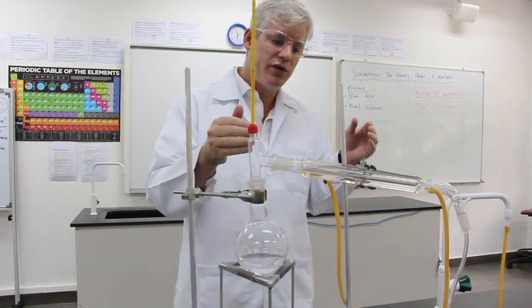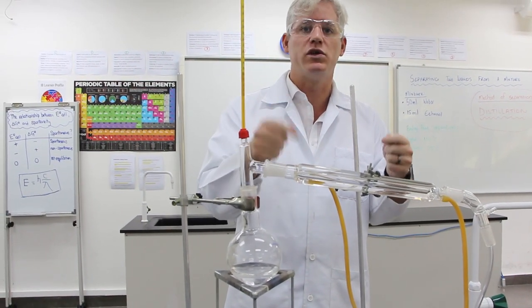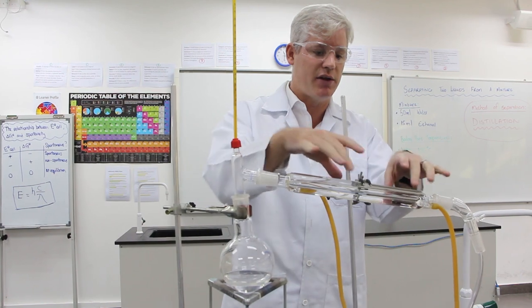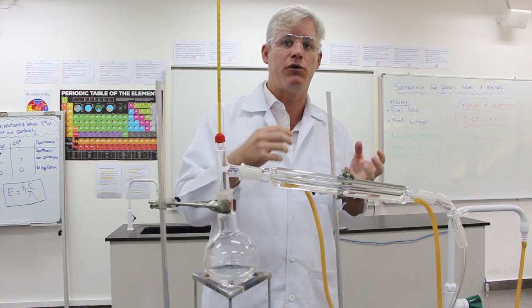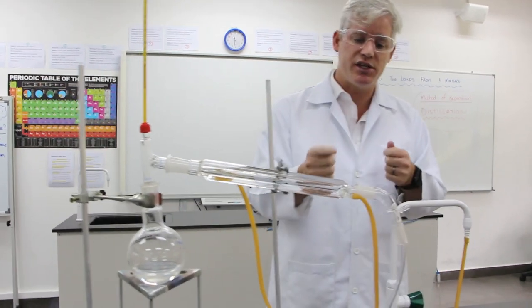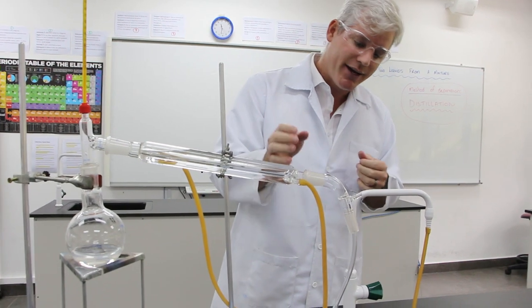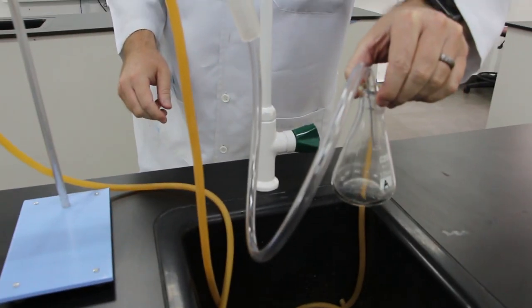It will then move down this apparatus. In this apparatus we've got cold water pumping through it along the outside. That will cool down the ethanol and turn it back into a liquid form. As it condensates, it will start to flow down these pipes and into this beaker over here.